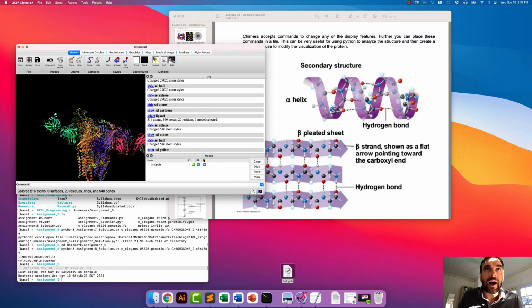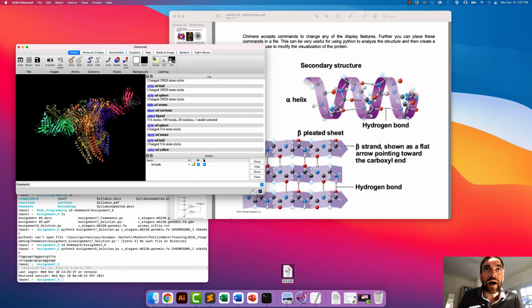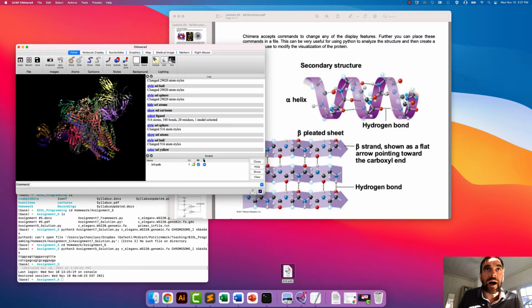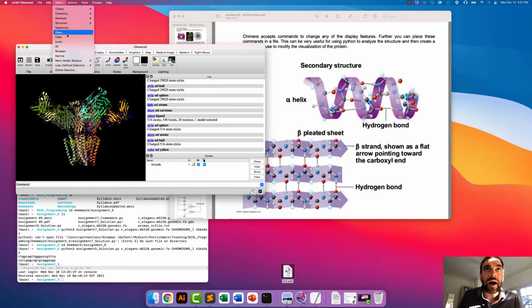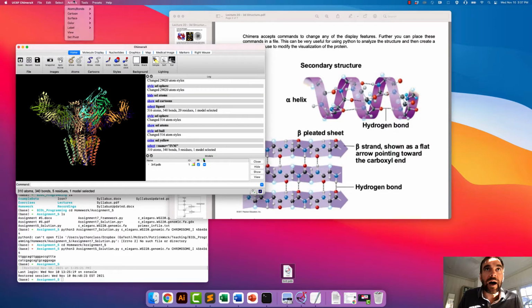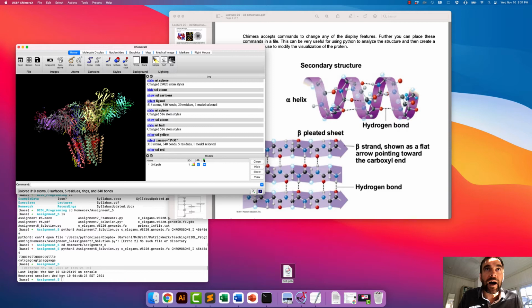So just as a reminder, this is the extracellular part of the protein right here, and this, sorry, I'm having trouble rotating it how I want it. So this is the extracellular part, this is where the transmembrane is, and then this is the interior part. So let's look specifically at the ivermectins, and we'll also give those a new color, red. And so now we can see where exactly the ivermectins bind to.